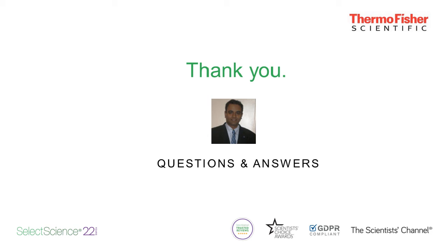First of all, I'd like to thank everybody for attending this conference. To answer this question, I would say that you need to dilute your samples so that the reading is between 0.1 and 2.5. Otherwise, you are using the instrument in a non-linear range, and you may not get accurate results. So if you want a proper measurement of how much DNA you have in your sample, that would be the approach.